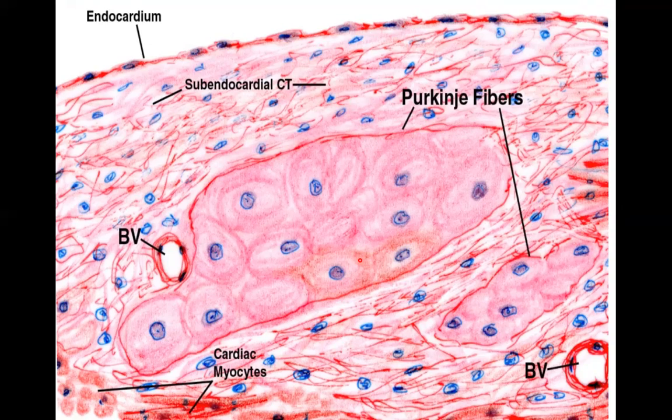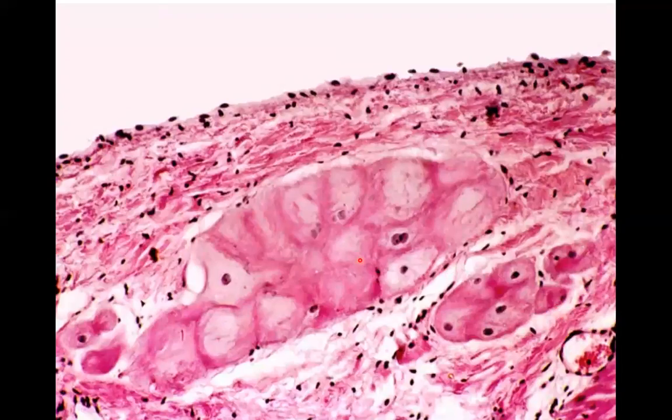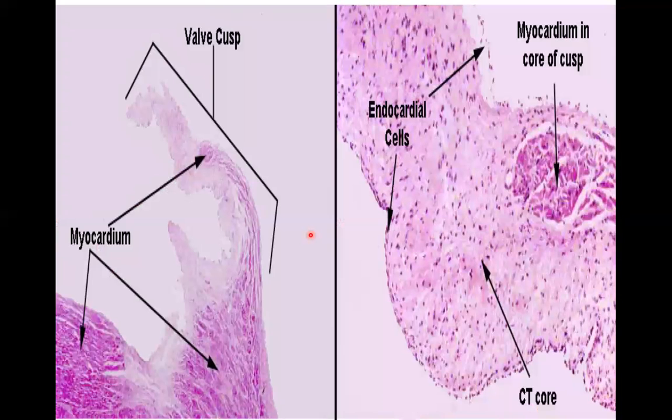This is under the light microscope. Look, this was a diagram, but this is under the microscope and we see it in this shape. Beautiful. You can see it in the slide. You can see it, or easily detect it. This is regarding the Purkinje fibers.